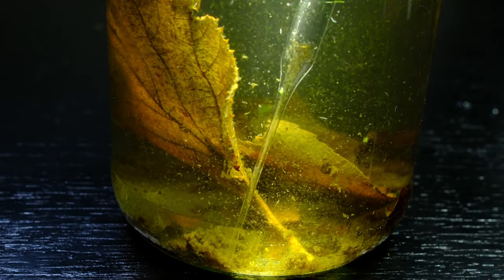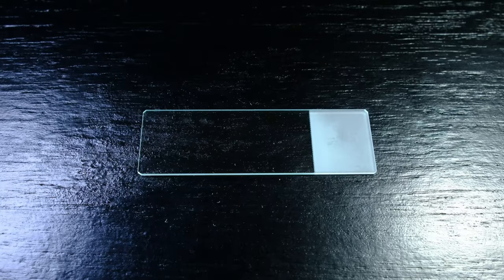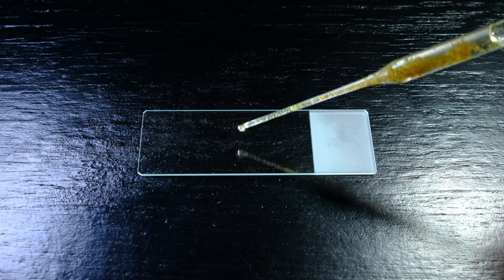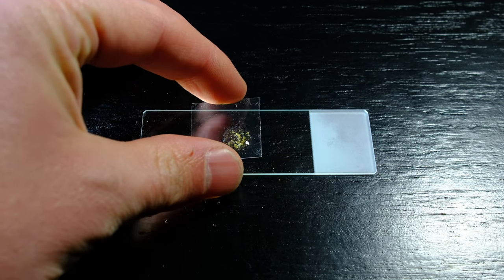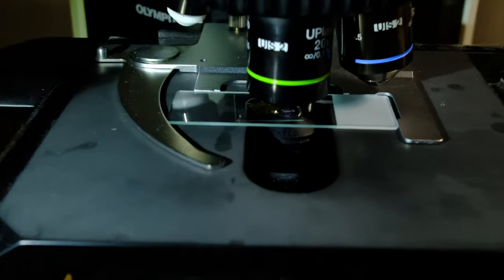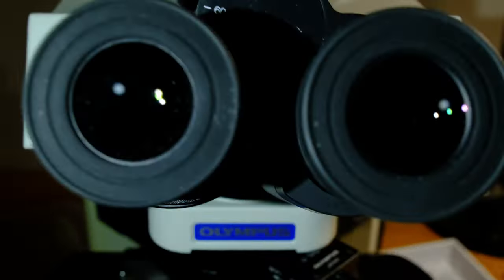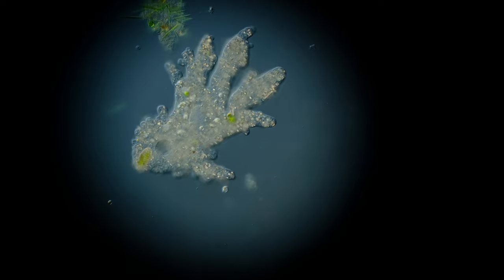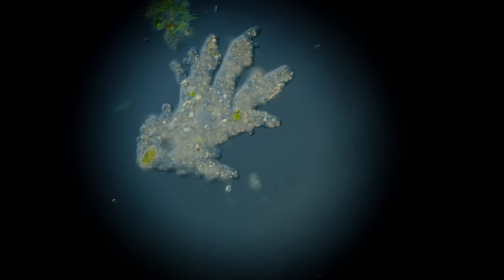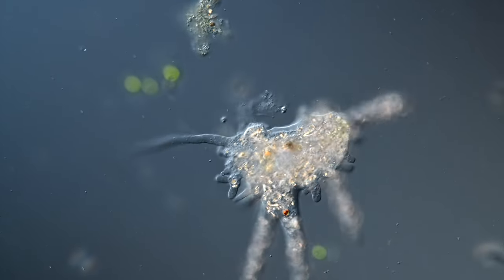Leaving the pond sample sit at room temperature for some days is called amplification. This process will cause the number of amoebas to increase only to a certain degree, but the population will not grow beyond a certain threshold. The amplified sample is just the basis for our nearly pure amoeba culture with high population density. We will use the pond sample only for inoculation. This is basically where we get our amoebas from. Check regularly with a microscope if you can spot amoeba Proteus.